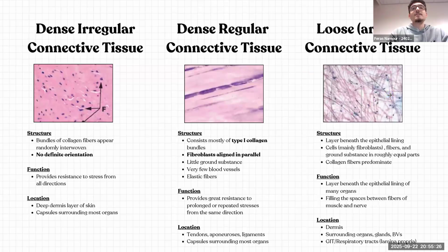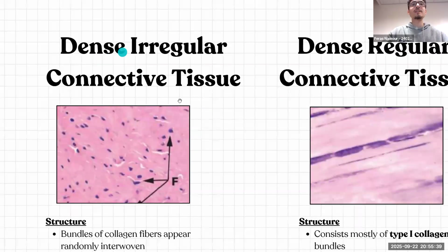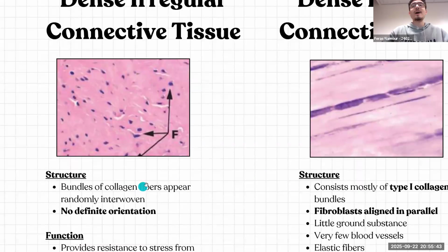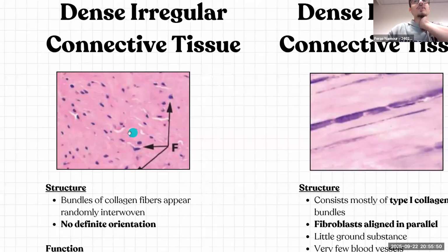And on to our final three slides, I think. Now let's talk about connective tissue. We said we were going to classify whether it's dense or loose, whether it's regular or irregular. Like here, I have dense irregular connective tissue. Connective tissue, meaning it's collagen fibers. Maybe I have some elastin, maybe I have some reticular, whatever it is. Let's say all of this is collagen, all right? This collagen here is dense, but it's irregular.